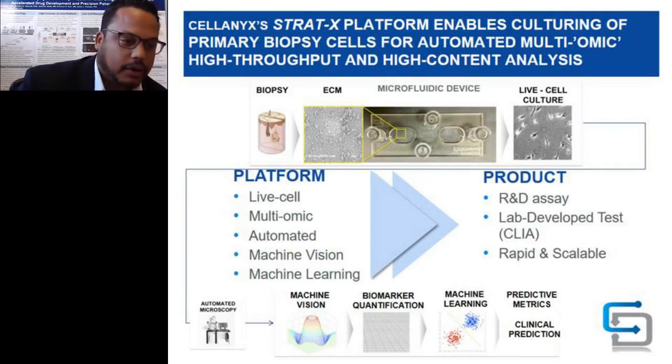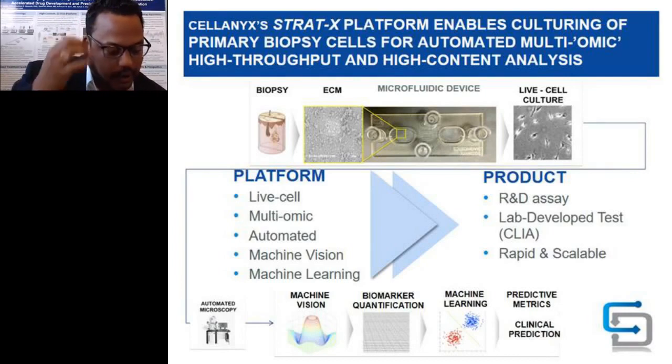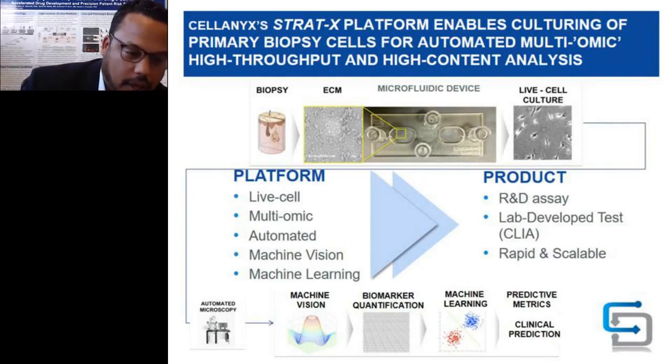Once the biomarkers and images of interest are collected, machine vision software can then simply analyze objectively and quantify biomarkers from those digitized images, and seamlessly those quantifications then get input into machine learning derived statistical algorithms that can generate predictive metrics that can facilitate the understanding of clinical outcomes such as metastasis, local progression, therapy response, and even upstream of that, biomarker validation.